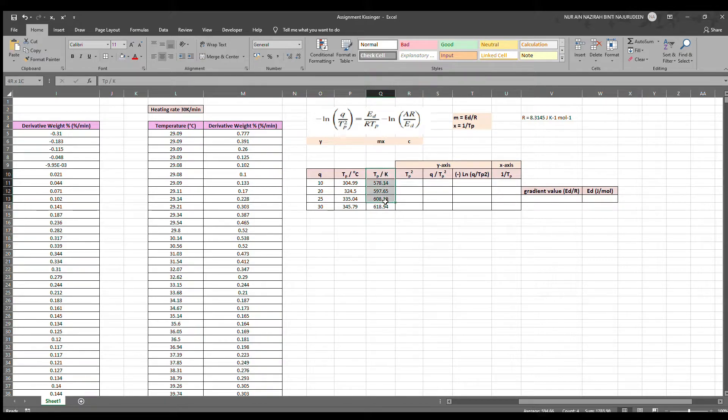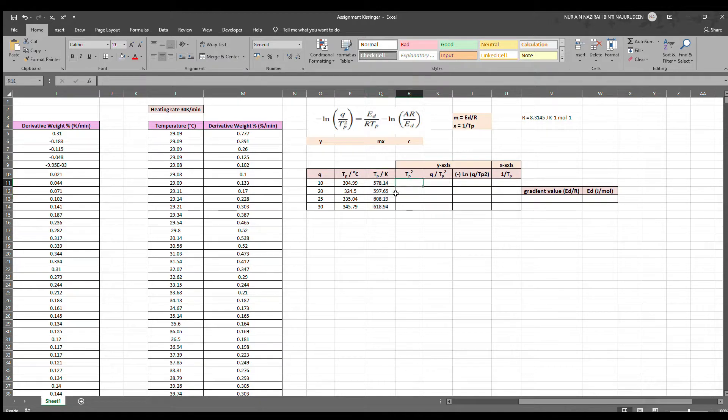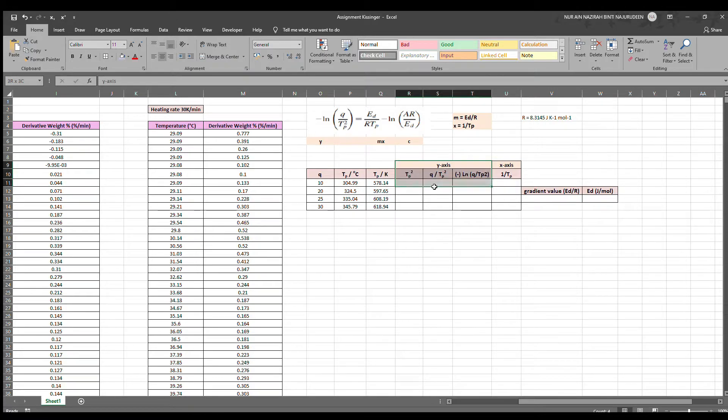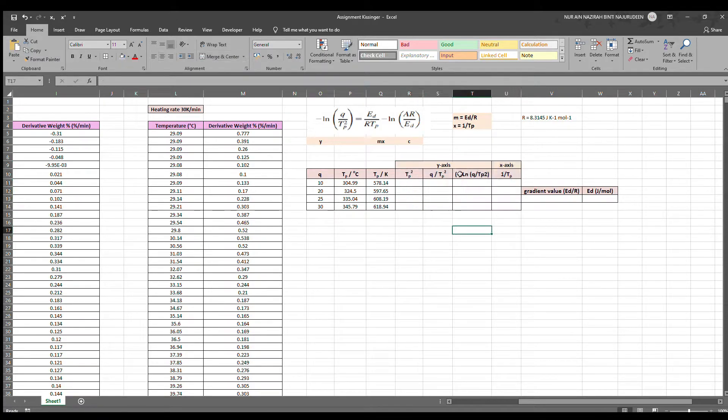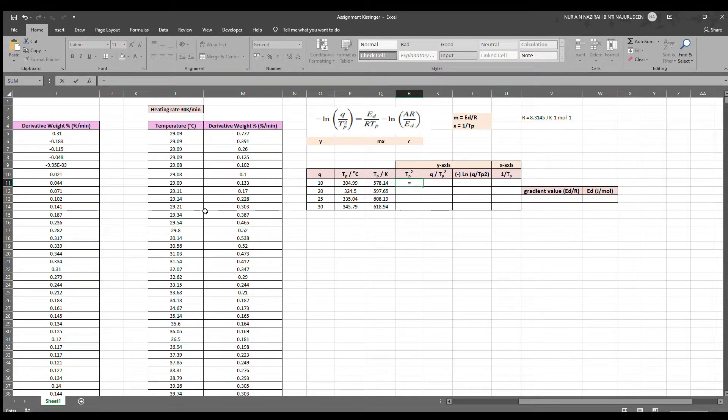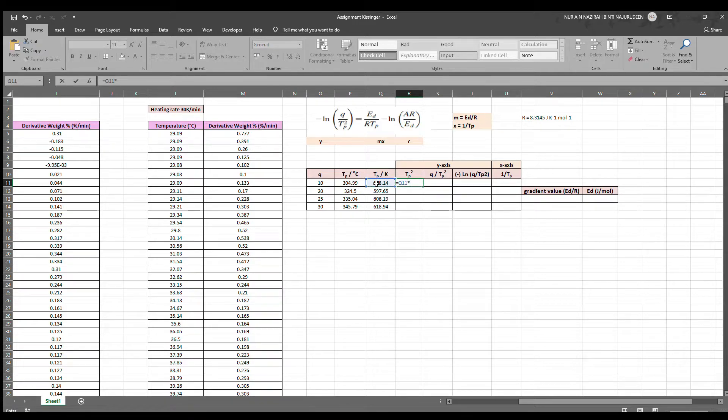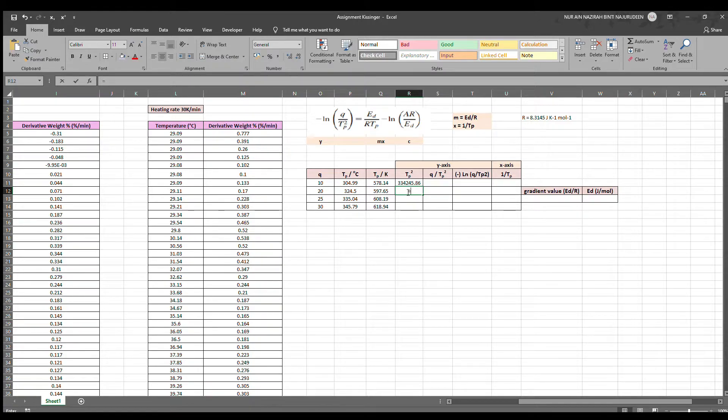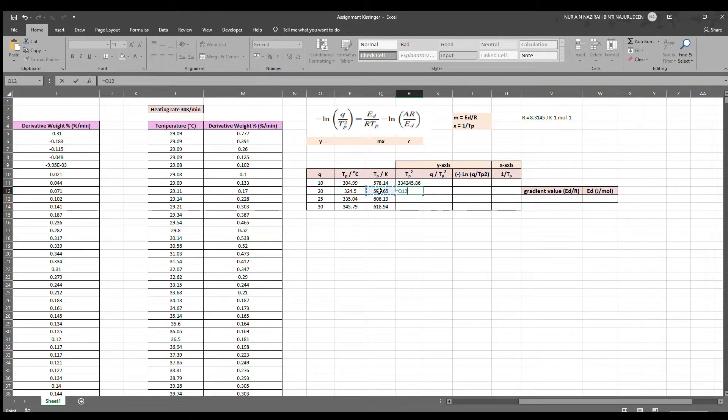After we have converted everything to Kelvin, we can now fill out the data to prepare to generate another graph of negative ln Q over TP squared versus 1 over TP. For TP squared, it is just TP in Kelvin times TP. And we do it for the other three data as well. We have to make sure that we press on the correct cell to obtain the correct value.